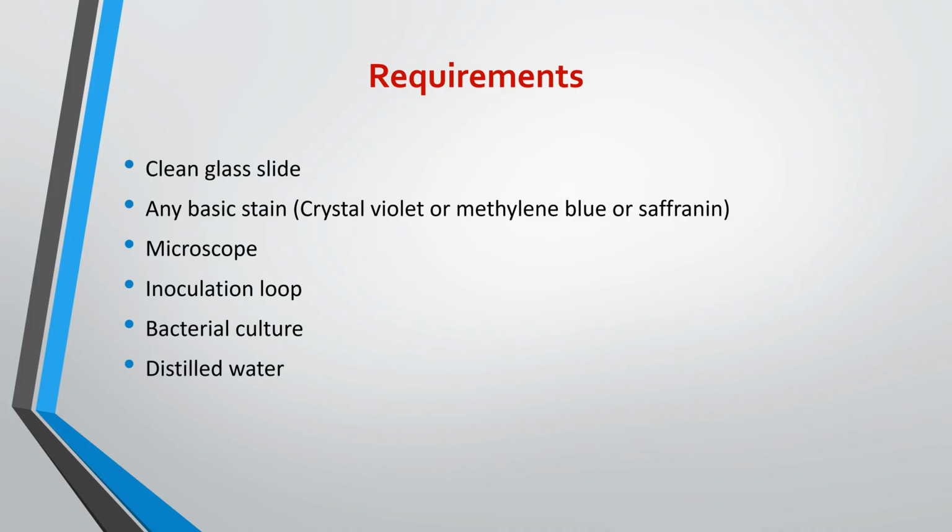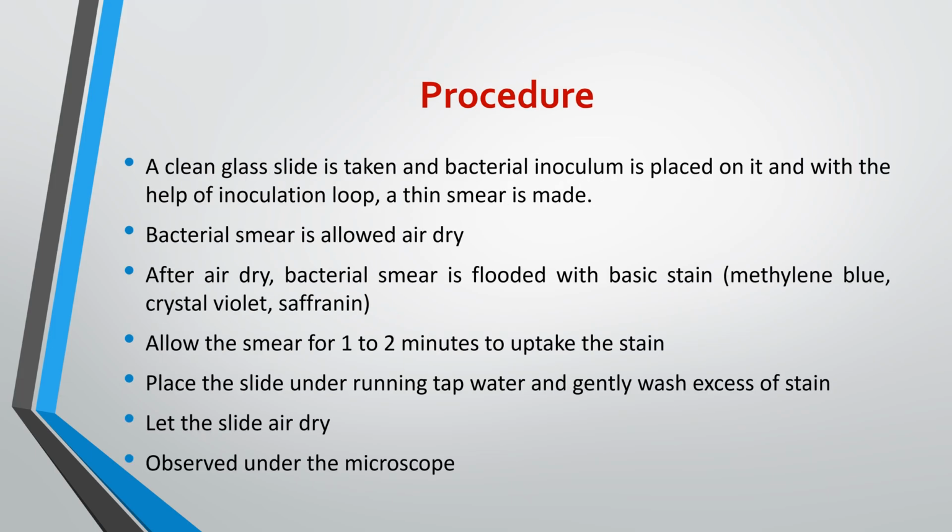Then coming to the procedure. A clean glass slide is taken and bacterial inoculum is placed on it, and with the help of an inoculation loop, a thin smear is made. Then the bacterial smear is allowed to air dry.